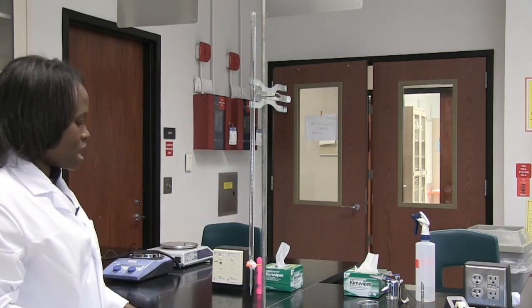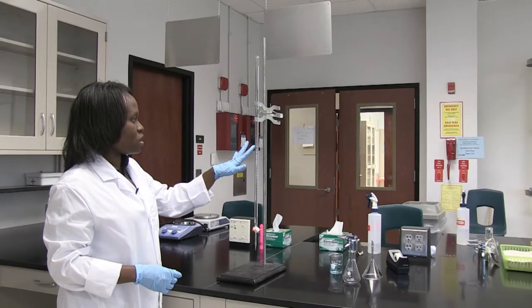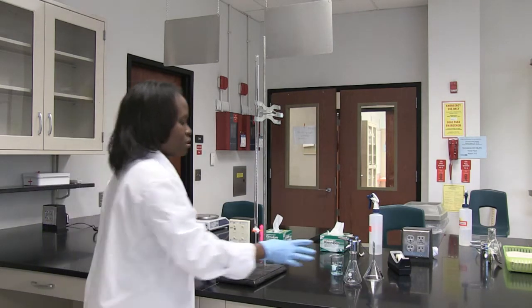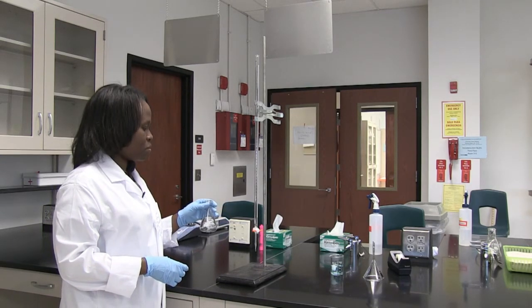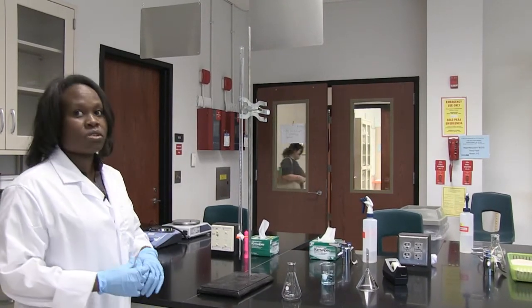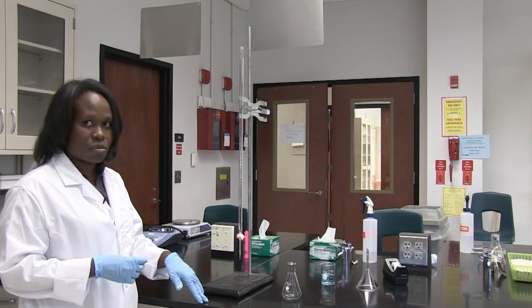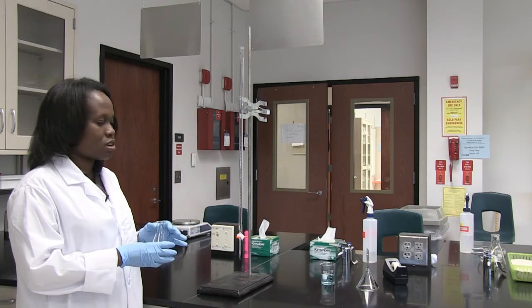So I'm going to start out by first showing you how to add a certain amount of volume to this burette, and then subsequently use the burette to add a specific volume to another container. Normally we use an Erlenmeyer flask when we are measuring using a burette, and the burette is also used for titration. You will see as time progresses, when we do a subsequent titration lab, that you're going to be using the burette to add a specific volume of liquid to the Erlenmeyer flask, and this is going to continue until an endpoint is reached.